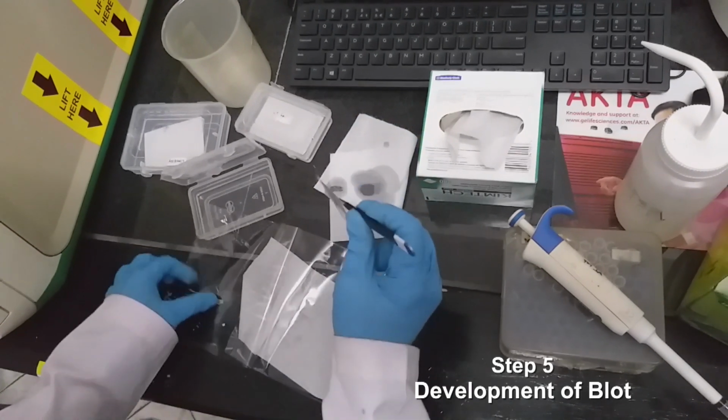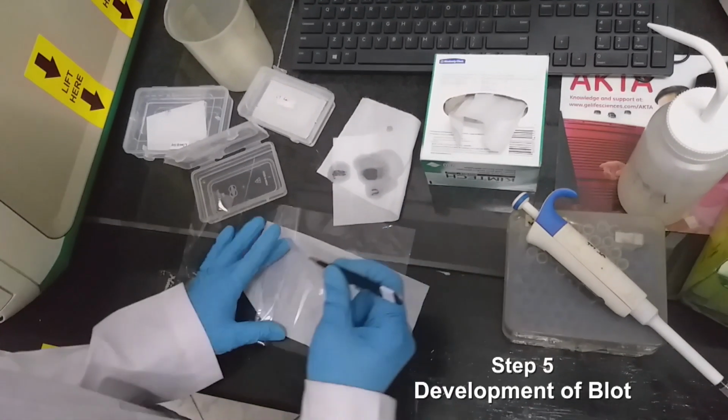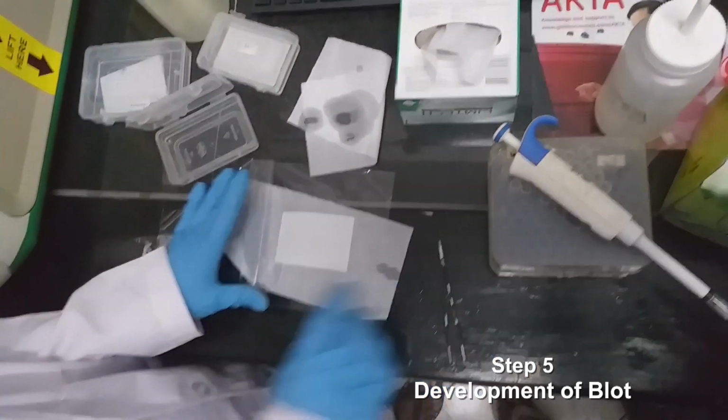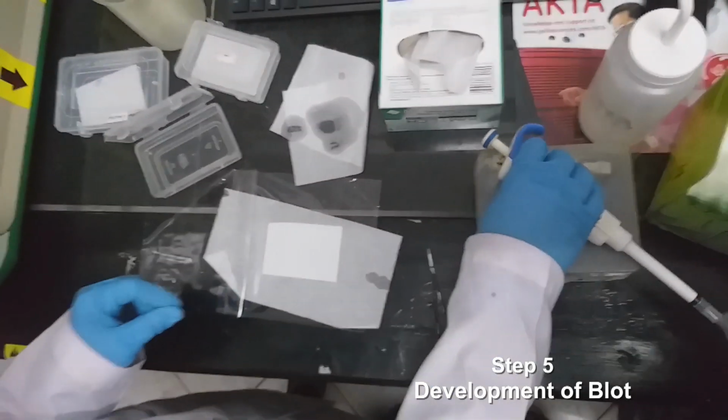After that we keep the blot in between plastic foils.